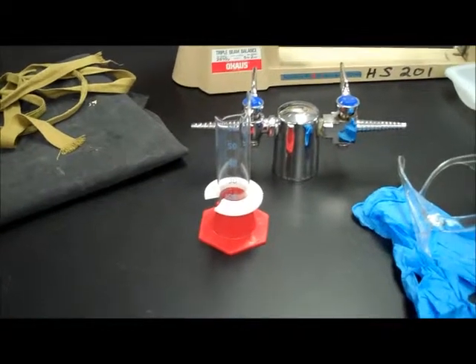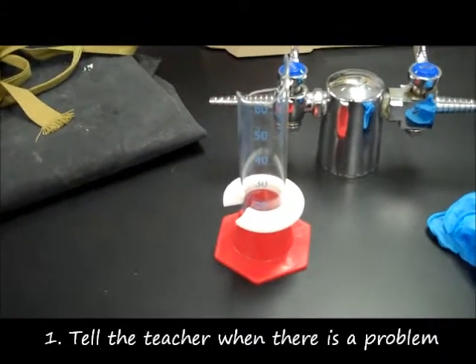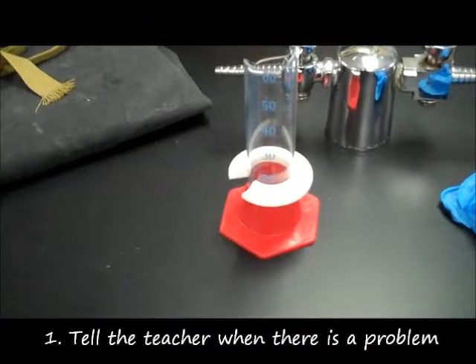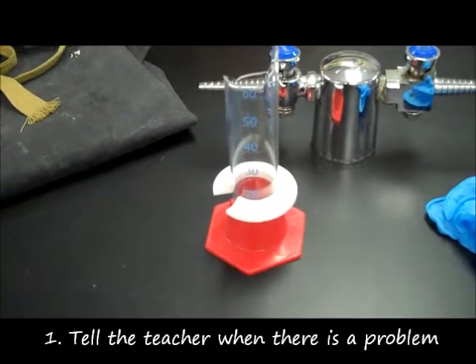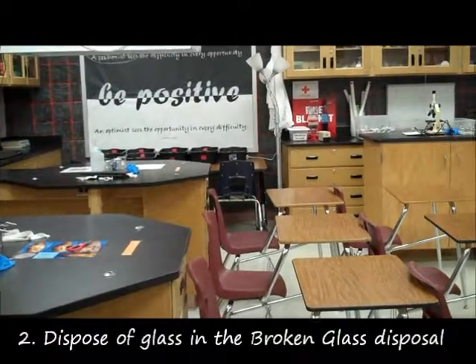Okay, at this first lab station, we have a situation in which your lab partner dropped a graduated cylinder and it broke. So what you should do in this situation is first go and get the teacher. Don't try to pick up the glass yourself, and I'll come and sweep it into a dustpan, and I'll take it to the broken glass disposal, which is at the back of the room. It's right next to the fire blanket.